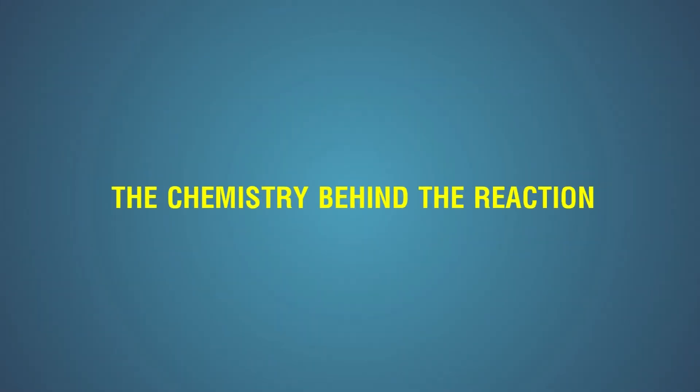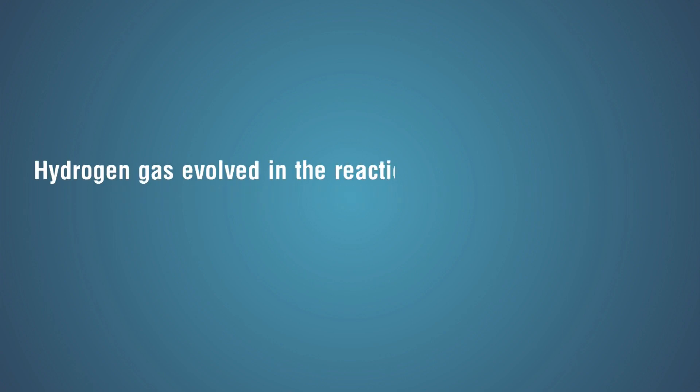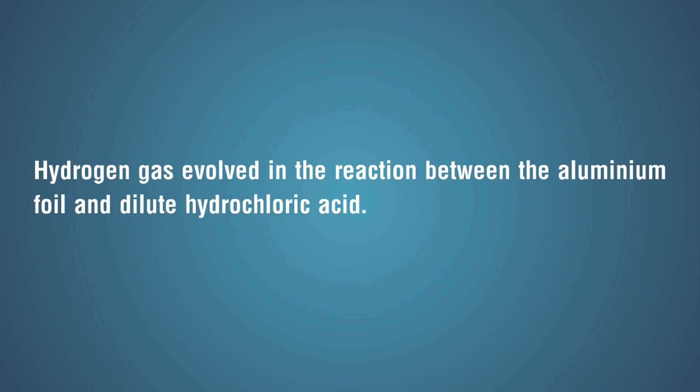The chemistry behind the reaction: hydrogen gas evolved in the reaction between the aluminium foil and dilute hydrochloric acid. Aluminium plus dilute hydrochloric acid gives aluminium chloride plus hydrogen gas.